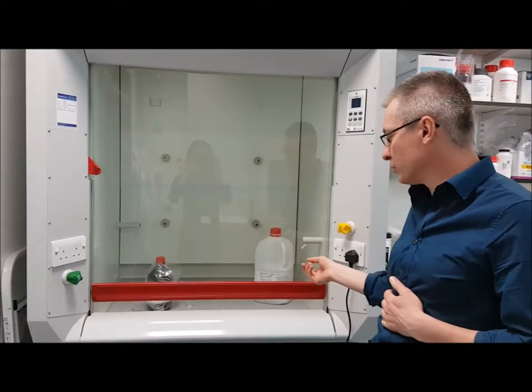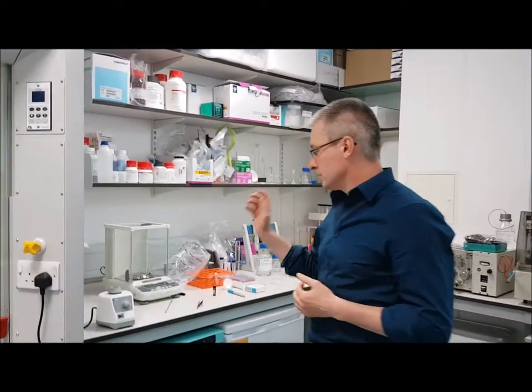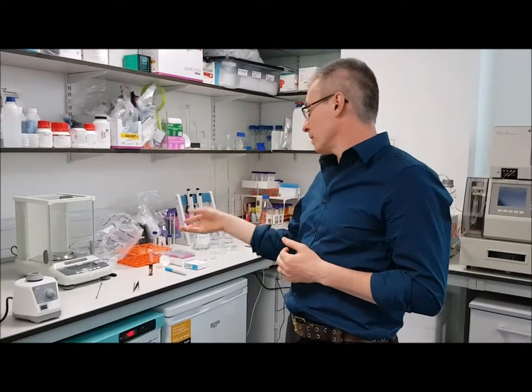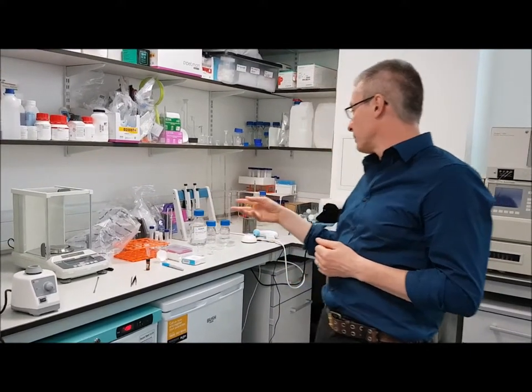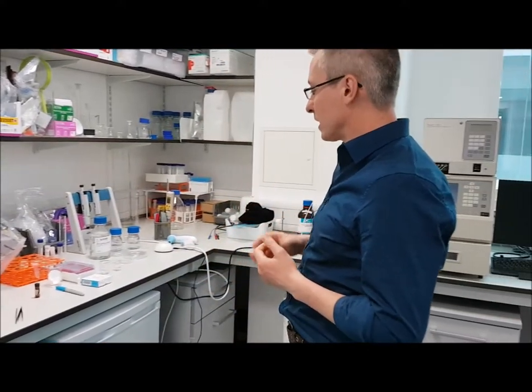We're in one of the other labs now. In here we have a fume hood, so this is going to do more chemical solvent type work. And in the lab, shakers, vortexes, and we also have the balances. This one has many more decimal points, so we can do much more accurate balancing, obviously the pipettes.